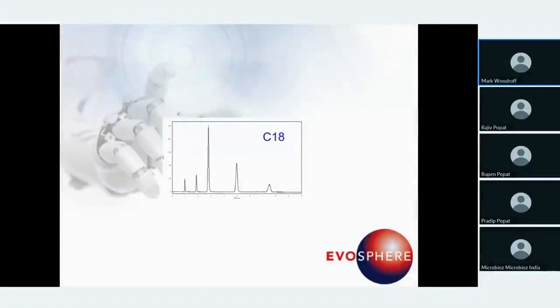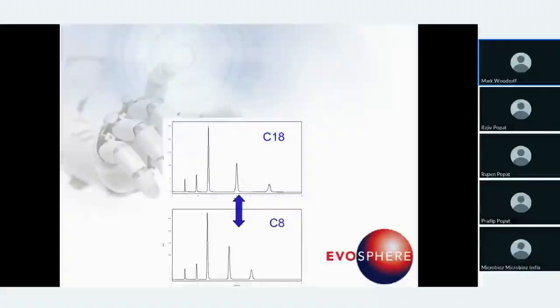Most people tend to turn around and say, well, the next column choice that I pick is a C8 column. The problem with doing this is that C8 is also a hydrophobic mechanism. So you are not really changing the selectivity term. Therefore, you won't really gain much more resolution by moving from a C18 to a C8 if you're doing method development.